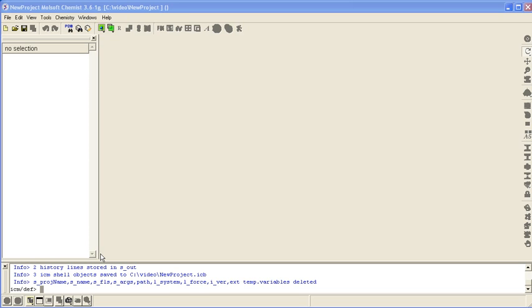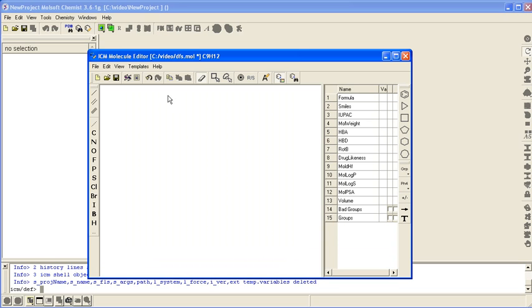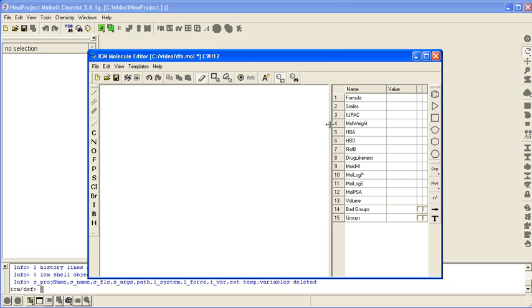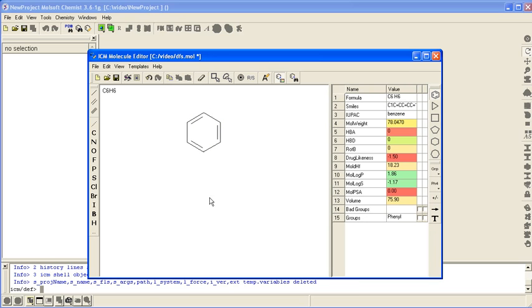How to sketch chemicals in ICM Chemist. Click on the Molecular Editor button. Use the templates that are available for sketching such as rings.